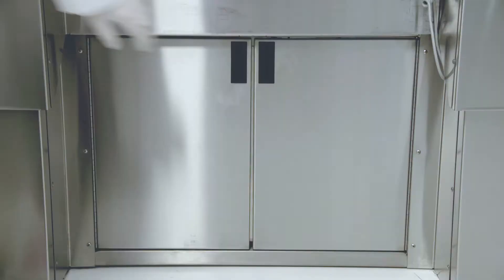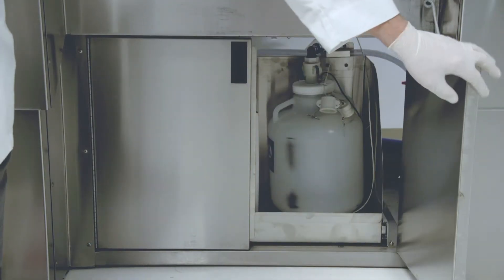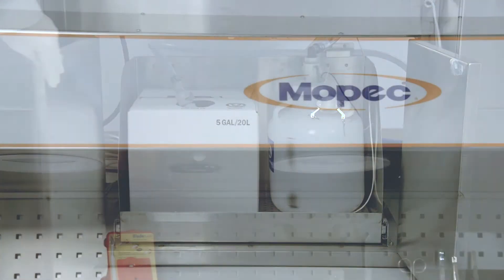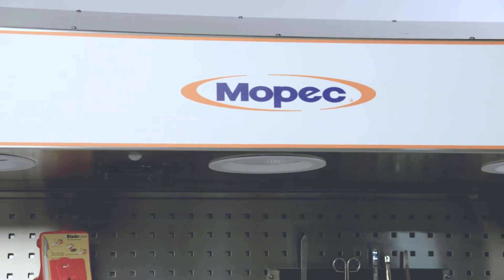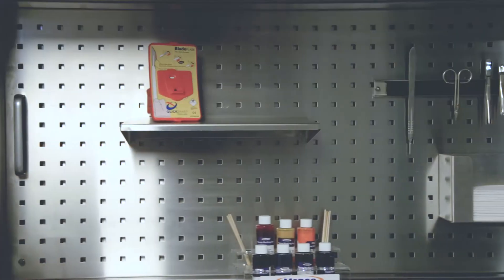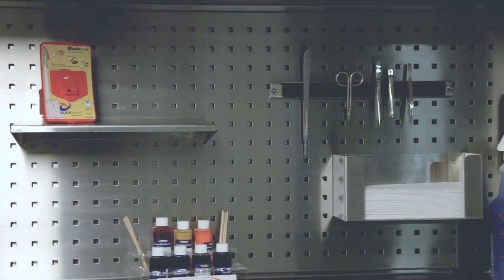The safest and most technologically advanced grossing station you can buy. Mopec has always been, and continues to be, your partner in customization, ensuring your workspace is ergonomically optimized.